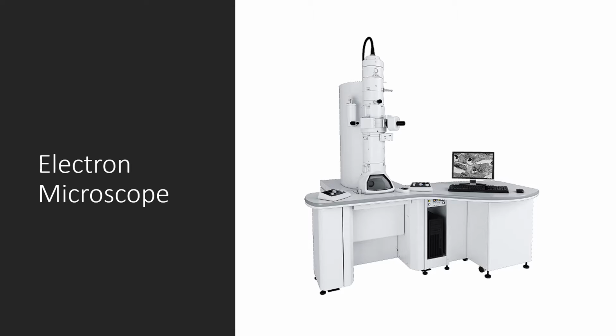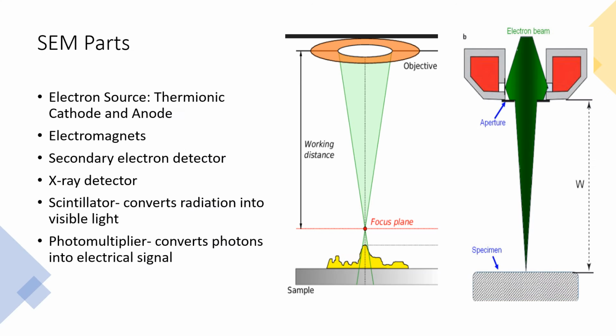And I'm not going to show you how the microscope looks because it looks pretty much the same, only the parts and working are different. So let's get started. See here, scanning electron microscopy parts. Now we have some different parts, but also some common parts like the electron source. The electron source produces the electron beam. And a thermionic cathode and anode help us to produce that electron beam.